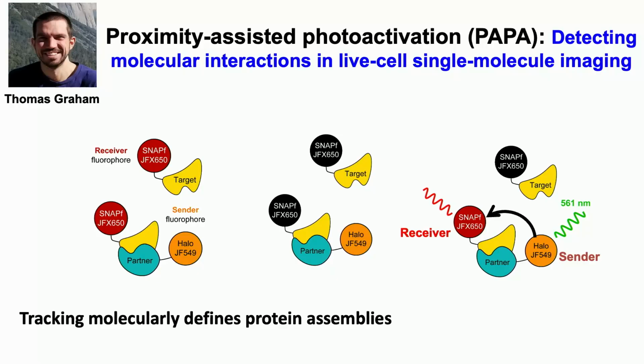And so Ignacio was looking in the green channel to image one of the proteins, and then he was bleaching the other. He decided to bleach the other protein and to image this one better, right? He had a little bit of leak, or he didn't. I mean, I don't know what he was thinking. I'm not sure he knows himself.